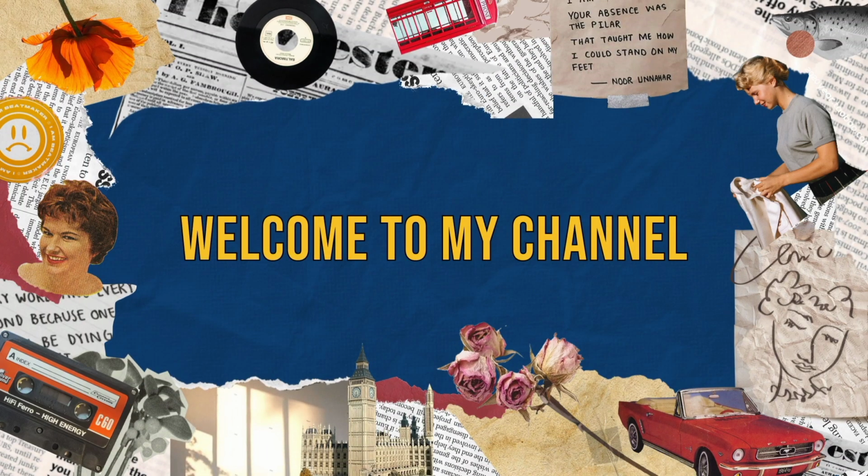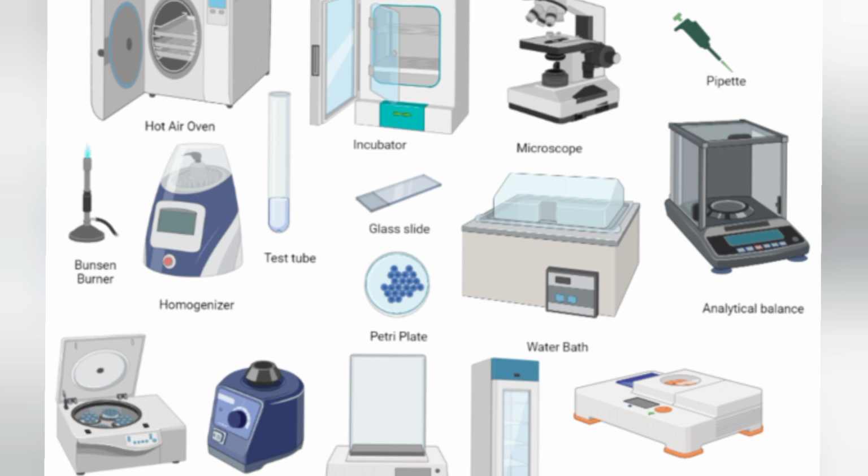So today I am going to introduce you to some lab equipments or pathology equipments along with their applications in the medical field.